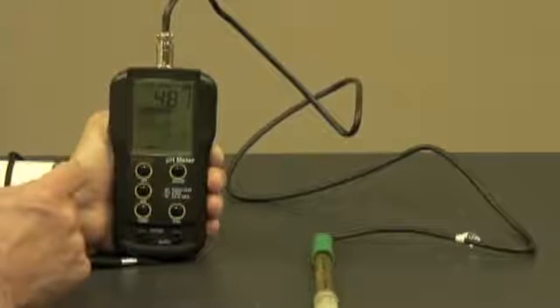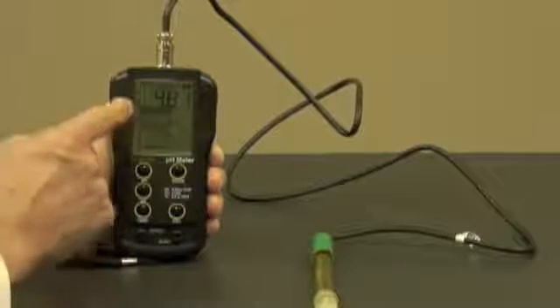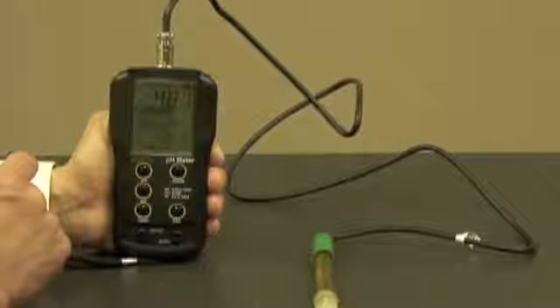An awesome feature about this meter is the fact that you have on-screen instructions for calibrating the probe. Next, let's use the meter.